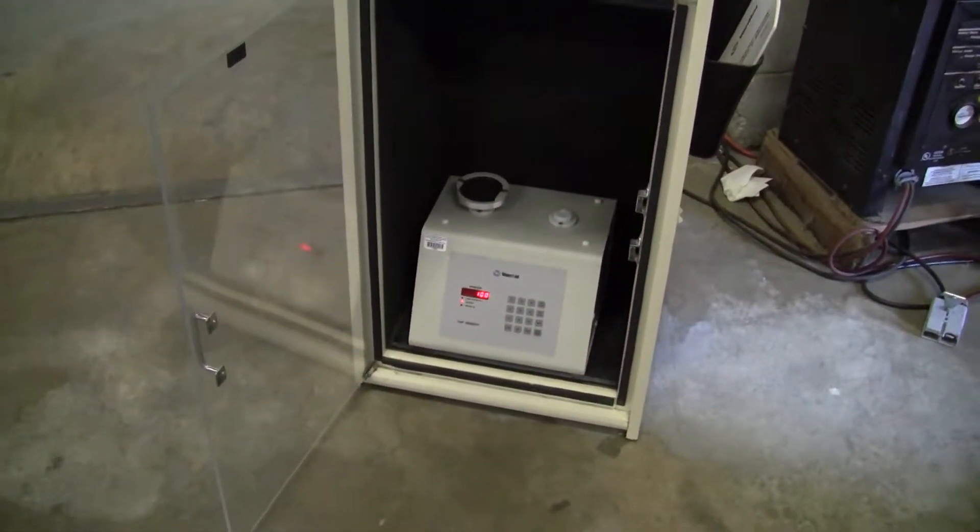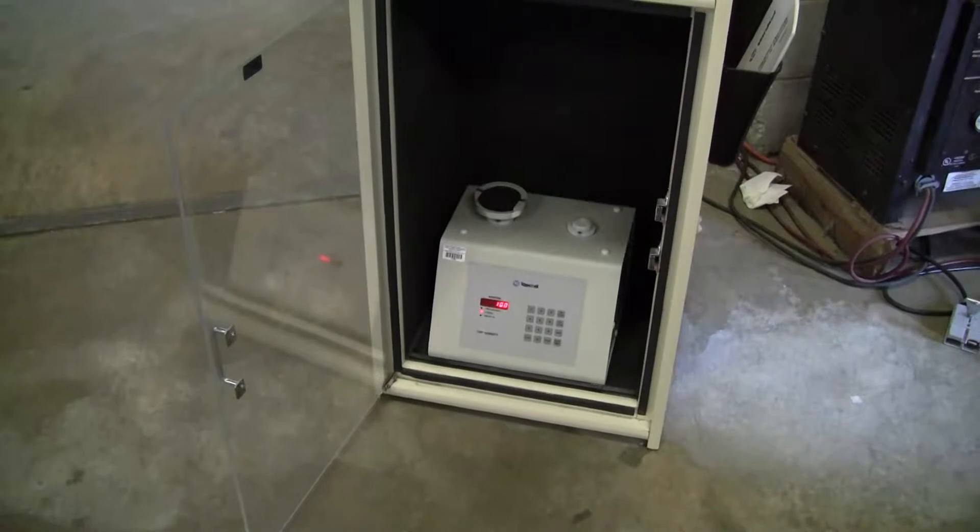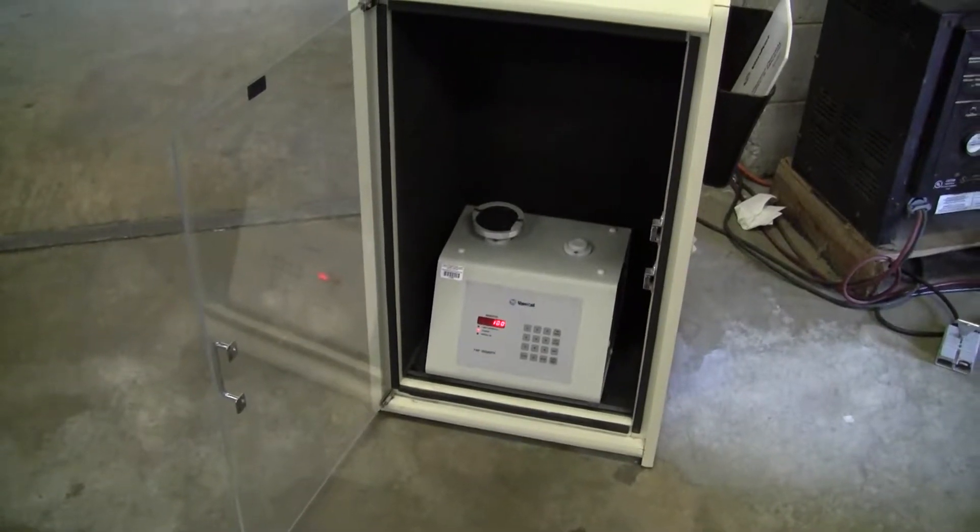Hi, this is Jim from HiTechTrader. We're looking at a Vanco tap density tester, model 50-1200.